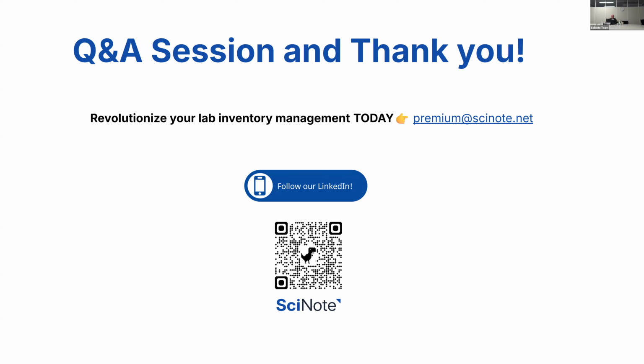Including expiration lots. So let me see. Okay, this is actually a full question. How to make it easier for scientists to record reagents, including expiration lots. Okay, so expiration lots, calibrations, all of this is connected to the sample. So you're going to find this under the item card. And when you link an inventory item in an executed protocol, can it automatically fill in the calibration due date to a table in the protocol?